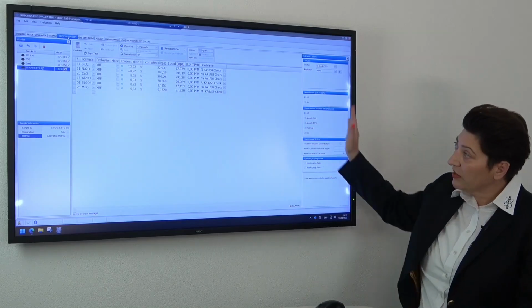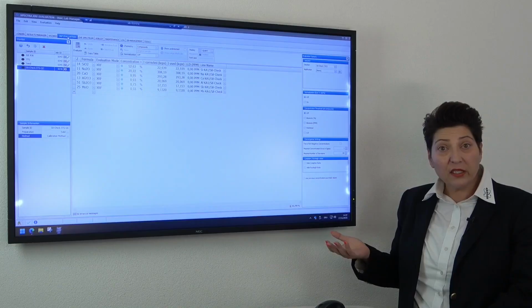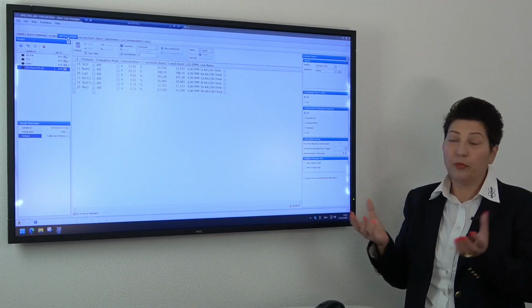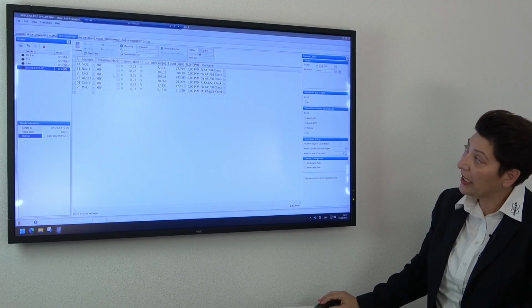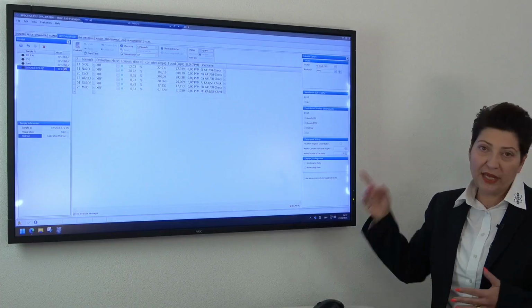So this is now the screen where typically the standardless measurements are evaluated, but you can also, of course, analyze or show any other method also used or run by a calibration. So here we have a big window where, first of all, you will get the elements which are analyzed. The results are displayed here. You can display much more information than shown here.